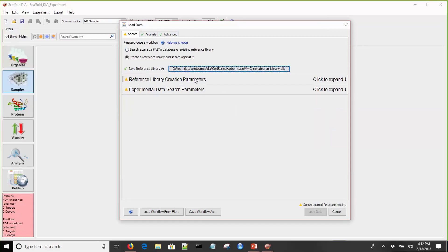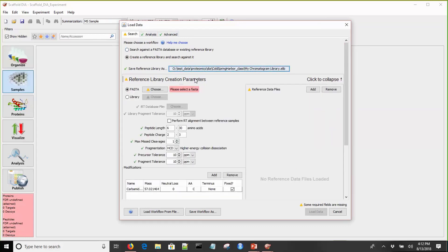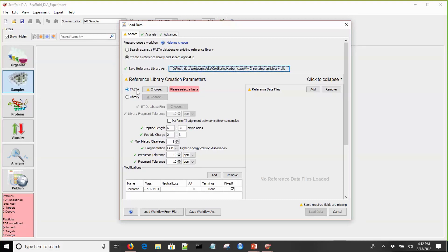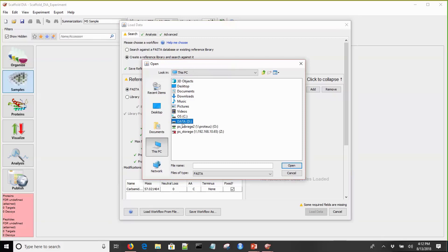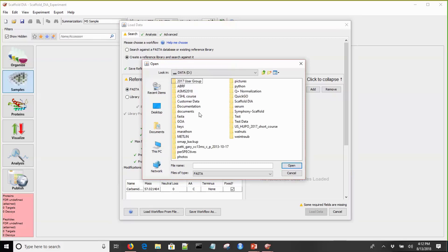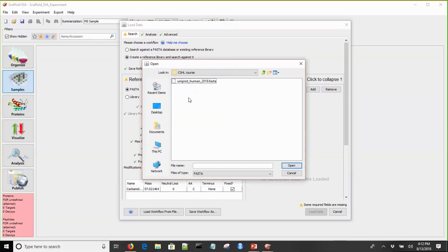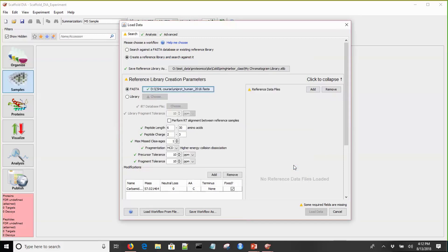Now let's expand the reference library creation parameter settings. This is where the bulk of the parameters live, all related to setting the parameters for the reference library search. You have options to use a FASTA or to use an existing BiblioSpec or ELIB library. We're going to use a FASTA. I'll navigate to where our FASTA file is stored on our computer. This is just a regular FASTA file downloaded from the UniProt server.